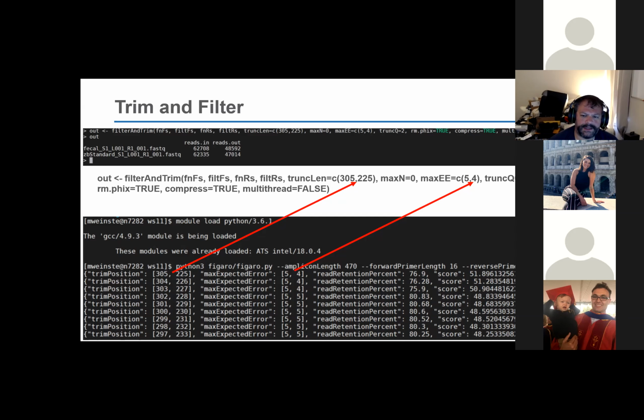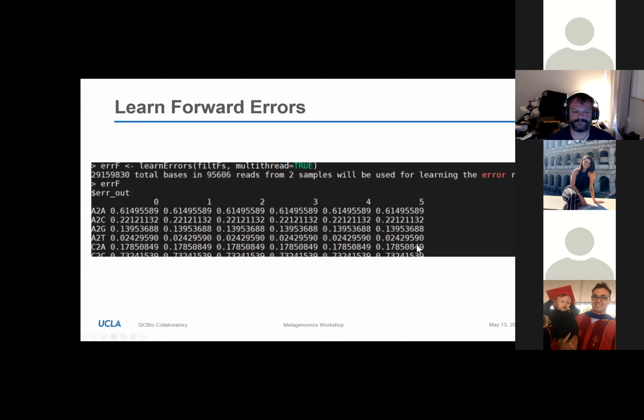All right, when you ran the command, did you copy and paste it from the PowerPoint slides or did you type it out by hand? I had typed it out by hand. Okay. But oh, you know what? Did you see something? What's up? Yeah, I think I figured it out, and it's good now. I'm getting the same reads in and reads out. Okay, cool. So I think I can keep going then.